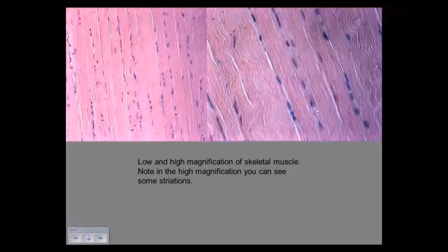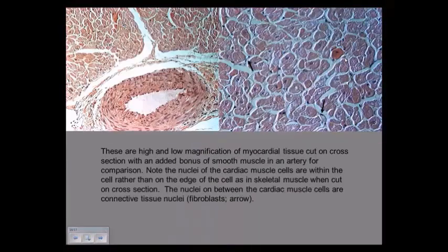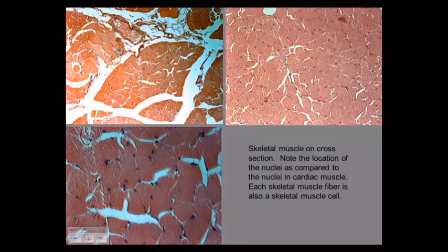What kind of tissue is this? You see striations. So your choices are two, cardiac muscle or skeletal. The nuclei are flat, skeletal muscle. There's no intercalated discs, skeletal muscle. Okay? Low power, the striations start to disappear. Higher power, they come into focus. This is skeletal muscle cut in cross section. Remember I showed you in the cardiac image, the nuclei are in the middle and they're oval. Here the nuclei are flat and on the periphery. Okay? On cross section. Pretty slick, huh?